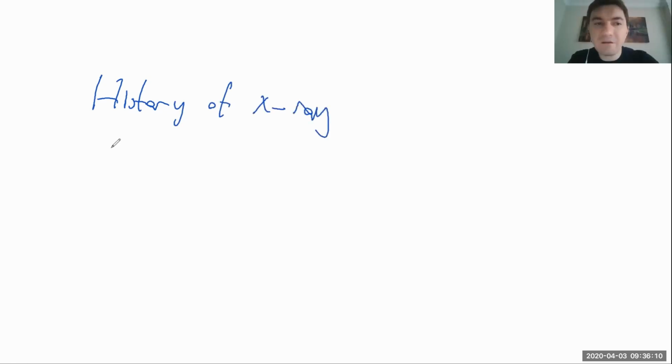We have seen X-ray sources, conventional X-ray sources, rotating anode tubes, and also cyclotron, synchrotrons, and free electron lasers.